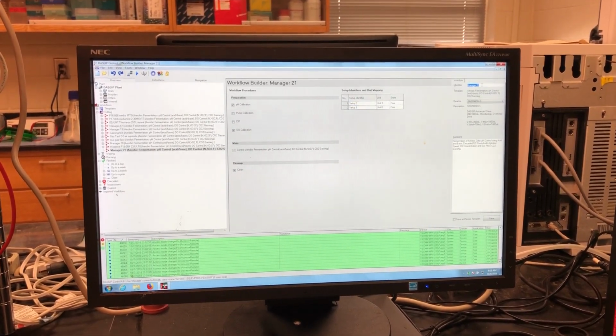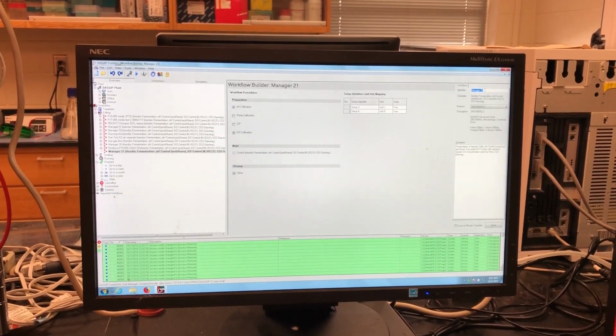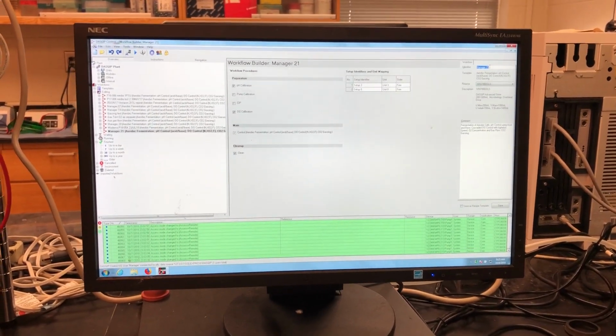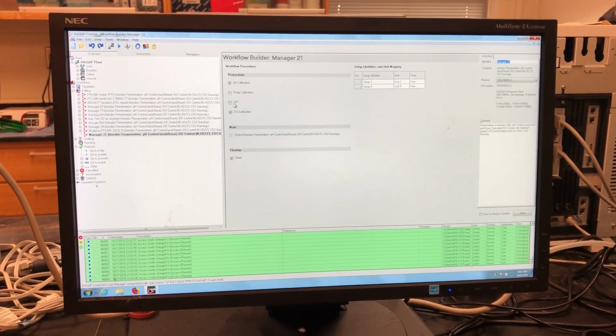The identifier here is the name of your run. You could just use the date and the client, or you could use an identifier number if the client gives you one of those. For Calion, they always use a K number identifier.